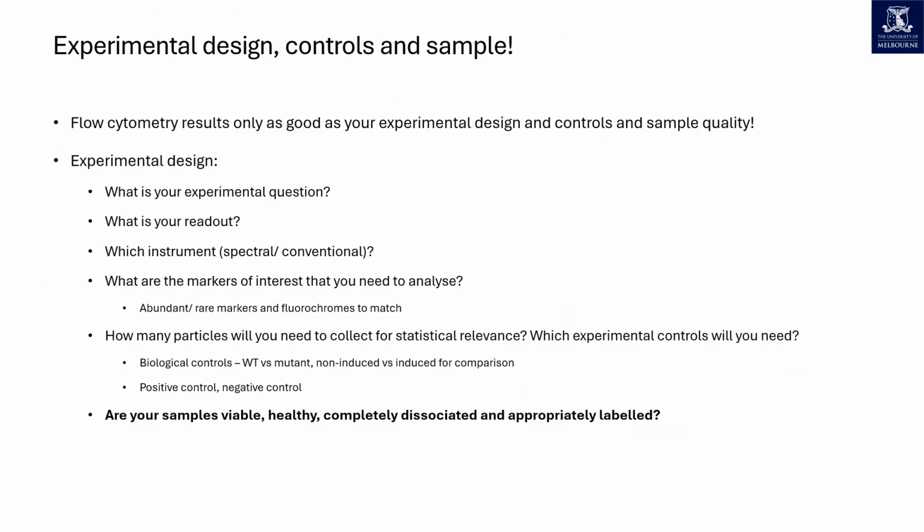To conclude, cytometry is a mind-blowing technology, but it is only as good as the experimental design and quality of the samples that go into it. The design phase may be extensive to select the appropriate controls and designing antibody panels and titrating reagents. As my mentor told me when I was a student, cytometry won't save a poorly designed experiment or resurrect unhealthy cells. It's garbage in, garbage out.